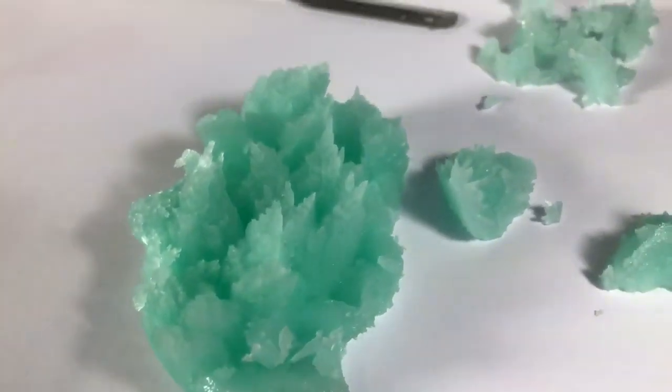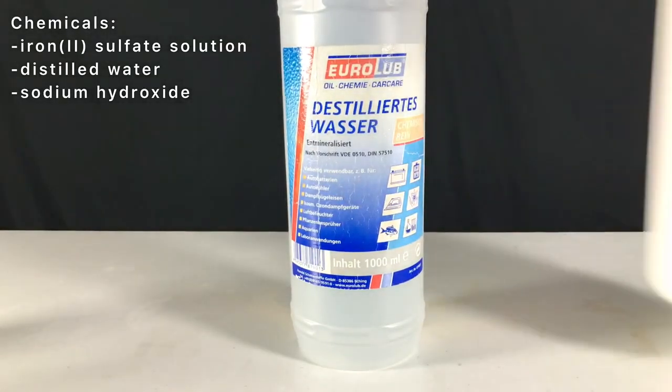In the previous video we prepared some iron 2 sulfate and we had some leftover solution of iron sulfate. Therefore, we are going to make iron hydroxide today.